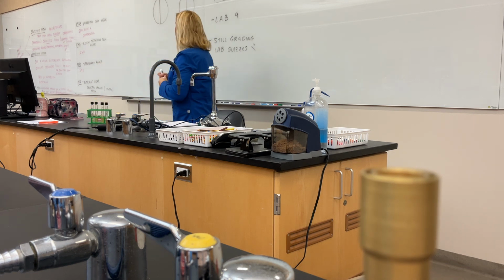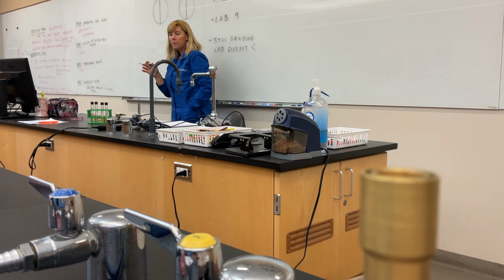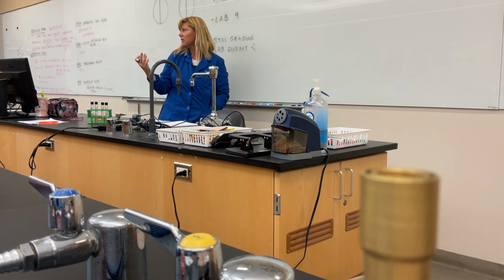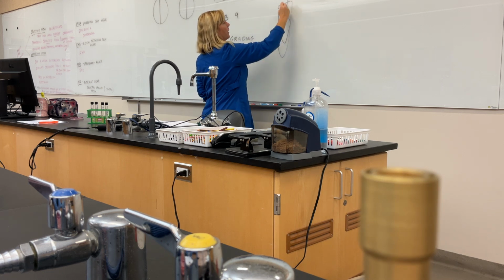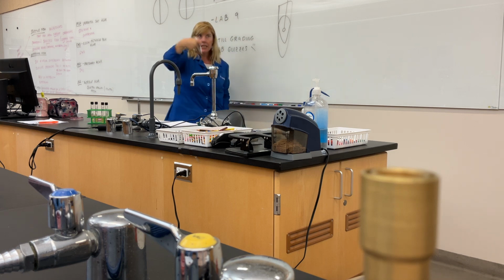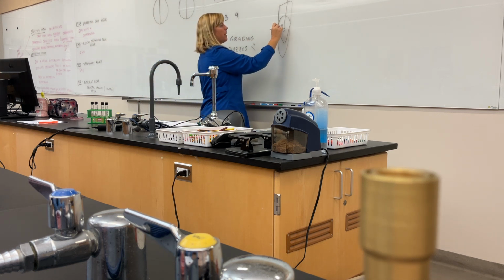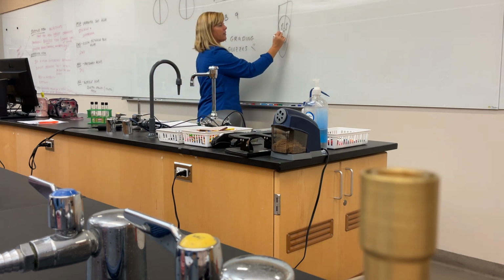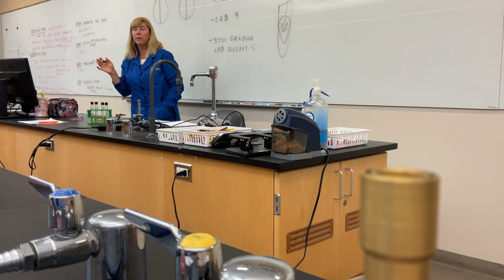Now, if I have, for example, Proteus, I'm going to sterilize my loop. I'm going to take my loop and gently scrape some Proteus. Do I need a whole lot? No, because this is dry growth. Couple of things to keep in mind. Remember, this is my slant here. When I go in with my loop, I am not digging. I'm not being rough. I'm very gently scraping upwards along the surface, and I will pick up a little bit of paste. And as soon as I see that paste, I'm done. Remember, I don't need a whole lot. It's kind of like when we did our slides.